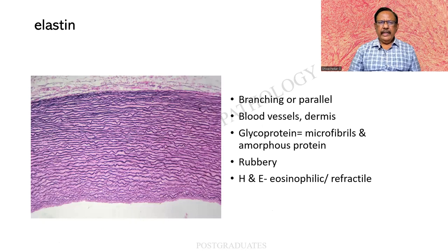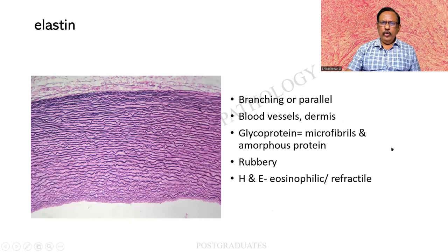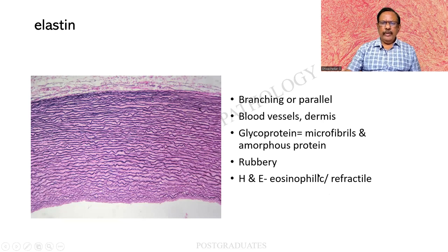This is another friend — the elastin. Beautiful, slender, wavy, parallel or branching fibres. They occur normally in the blood vessels and in the dermis. Elastin is a glycoprotein equal to microfibrils plus amorphous protein. The elastin by itself has a rubbery consistency — that is why it can recoil. Under routine H&E stains, they are all eosinophilic and refractile. But here each fibril has been individually brought out beautifully.